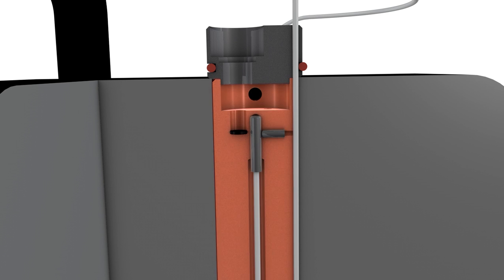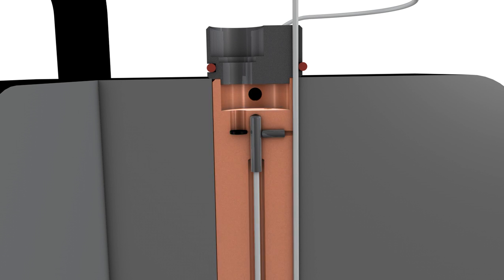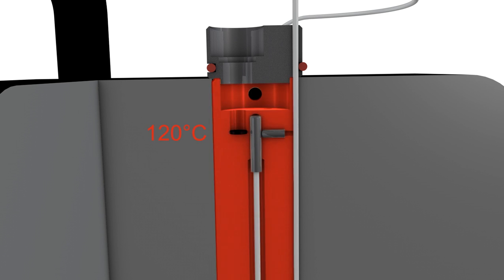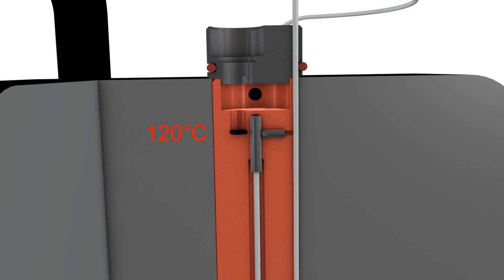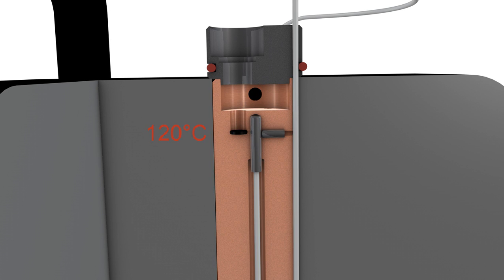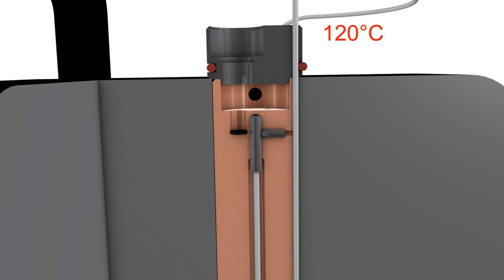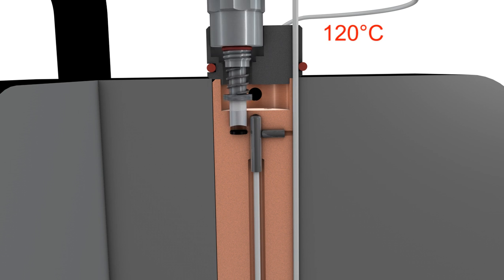We recommend that a reference sensor be mounted in the calibrator close to the clamp-on temperature sensor being calibrated. As you can see here, the reference sensor indicates 120 degrees Celsius. The sensor being calibrated is placed in the customized insert.